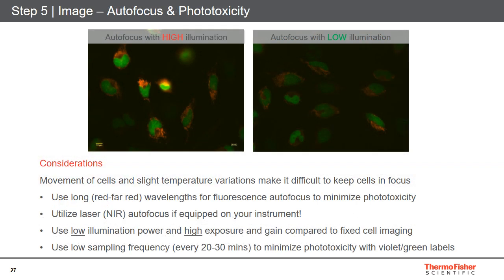Now, in order to generate that type of data, it is important to, of course, keep your image in focus, and that can actually be pretty challenging when it comes to imaging live cells, because live cells are still alive and therefore they're moving. And they're not only moving laterally, or in X and Y, but there's also slight shifts in their Z position based on small adjustments and small shifts in the temperature, as well as potentially even the stage of your microscope, depending on the type of instrument that you're using.